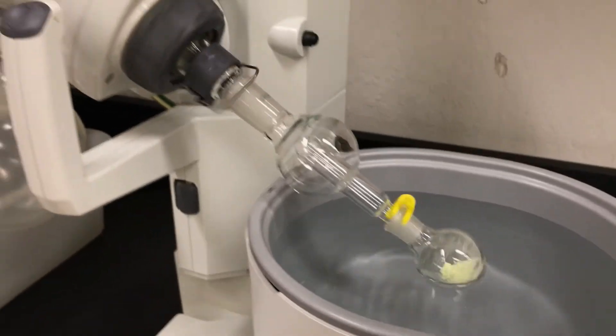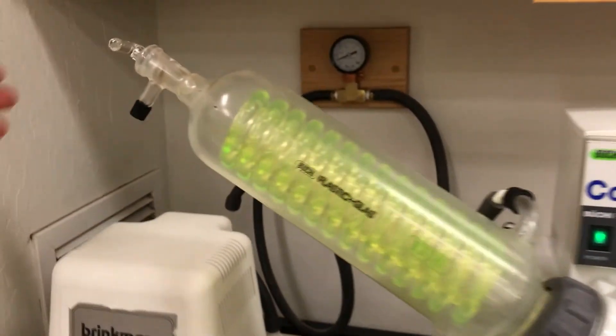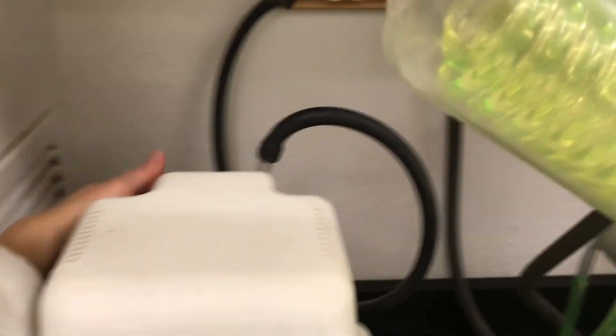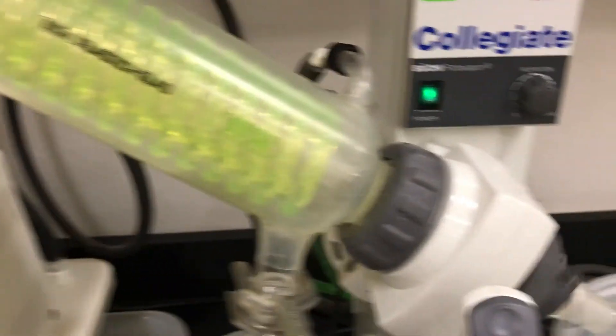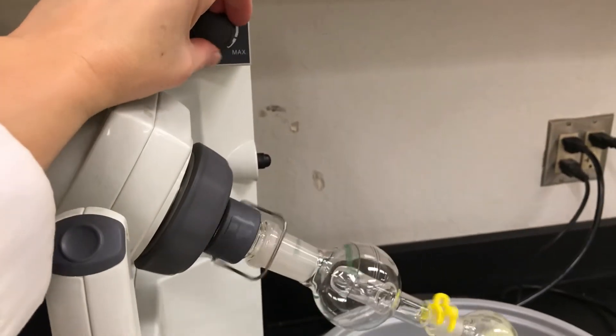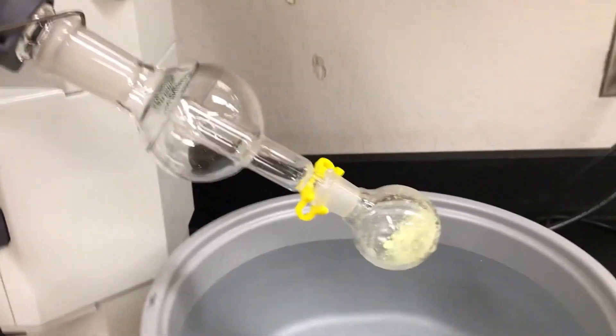When the solvent is removed and you're done you're then going to just do all the steps in reverse. First turn the stopcock to open it up to the atmosphere, turn off the vacuum, raise the flask out of the water bath, and stop the rotation. And at that point you can take the flask off.